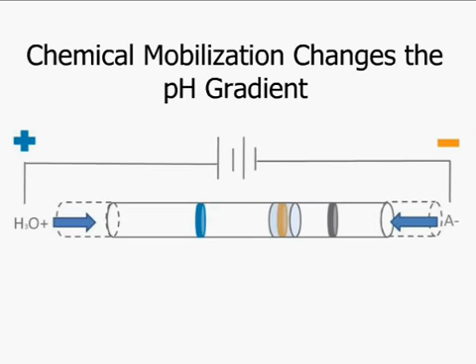Resolution can be maintained through the chemical mobilization process. Typically, replacing the catholyte solution with a weak acid or salt reduces the pH of the gradient, moving the pH gradient past the detection window. The major disadvantage of this method is that it disrupts the relative spacing of the gradient, which can create large deviations between actual and calculated pI, especially in the range of pH 8 to 9.